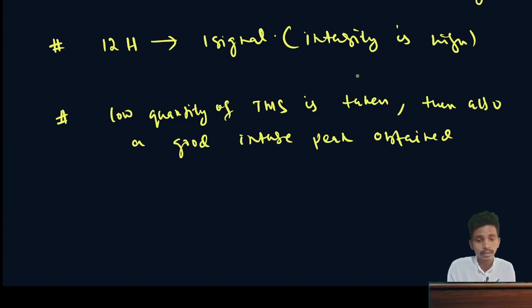So we need to take only a very low quantity, and we do not need to prepare more and more. By taking a low quantity, we can easily characterize our molecules using this as a reference.